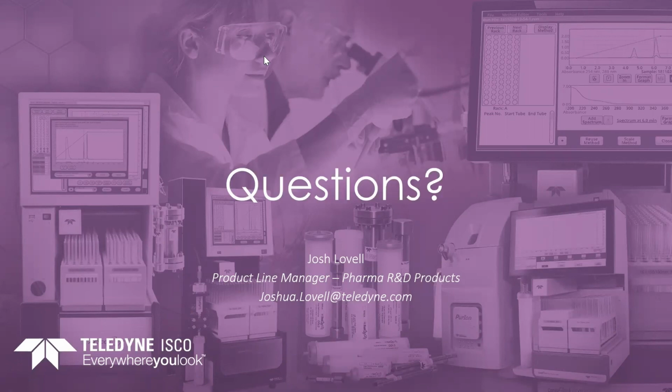The nice thing is that you can build that wash step into your method. If you do need to do that every single run, you can do that at the tail end. And if you're doing sequential injections with the solvent selection valve, you have the B1 and the B2 solvent, and you can automatically switch from, say you're doing a water methanol gradient, you could then switch to a stronger solvent like acetone to do the column wash at the end of each run as part of the method. So you can build that in easily with the Peak Track software and the solvent selection valve. So that's a really good question, but it is sample dependent. Sometimes you don't need to do that wash every time, and you can save solvent by doing that wash maybe at the end of a series of injections instead to make sure that your column's clean and ready to go for next time.